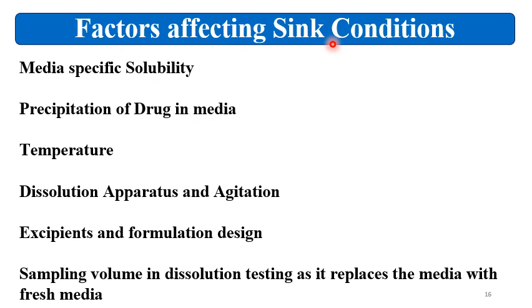Now, what are the factors affecting sink conditions? So, mainly the media specific solubility. Media specific solubility may have impact of pH, impact of ionic strength, impact of presence or absence of the surfactants, then precipitation of the drug in the medias, temperature, dissolution apparatus and agitation.